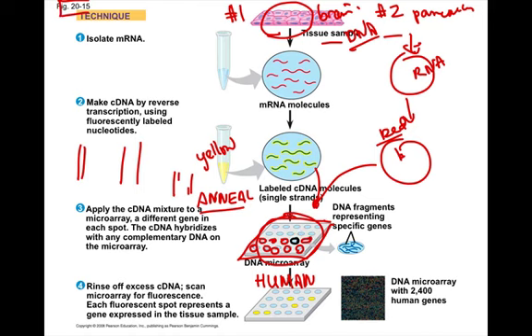them all. And at the proper temperature that will allow the DNAs to zip together, this RNA is mixed with the DNA and gets zipped together. And so any genes that are expressed in the brain will be tagged with a yellow on their RNA, and then those will glow yellow after the annealing is done. And on the other hand, any genes that are expressed in the pancreas will glow red.